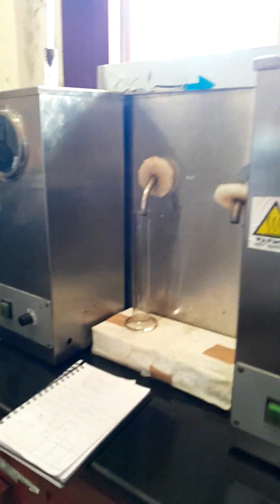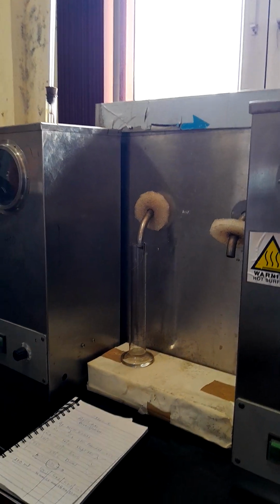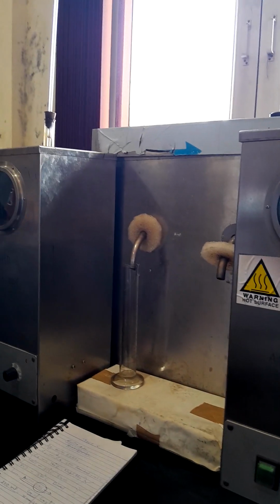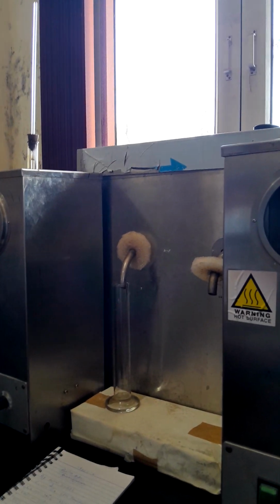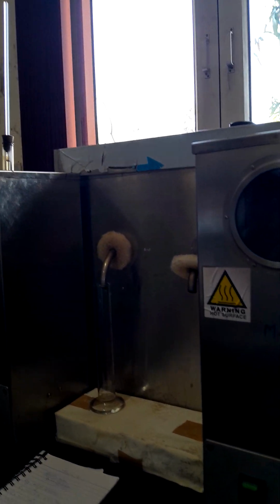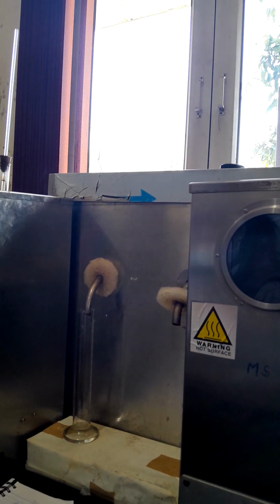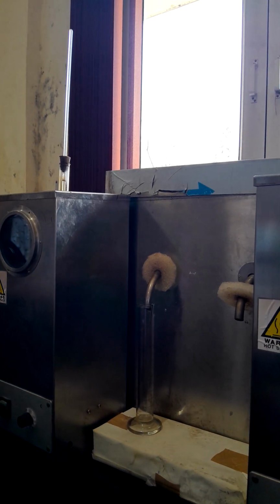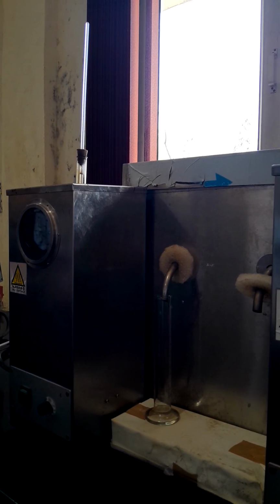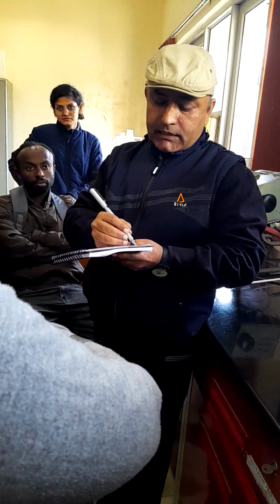Here what will we check? We will check the initial boiling point, then recovery of the volume at 5% temperature, 10% temperature, 20% temperature, then 30, 40, 50, 60, 70, 80, 90, then 95. After that, FBP, final boiling point, then recovery, then residue, then loss. Now, because I am doing diesel, definitely I will talk about the diesel. While you are doing the diesel, you will check the IBP.